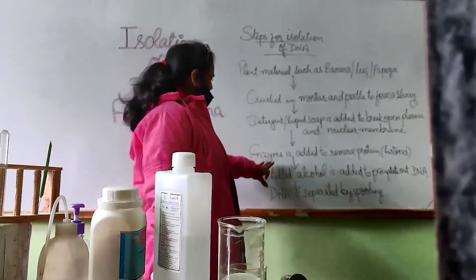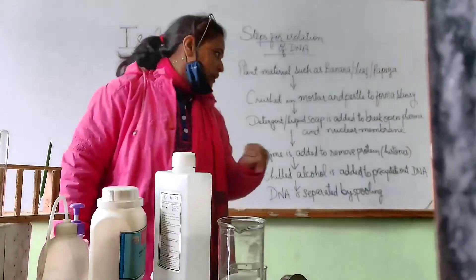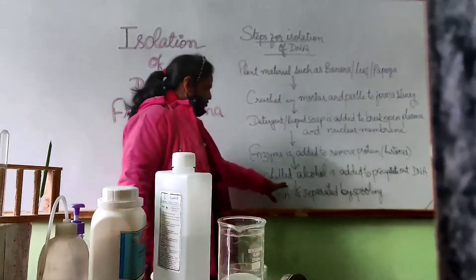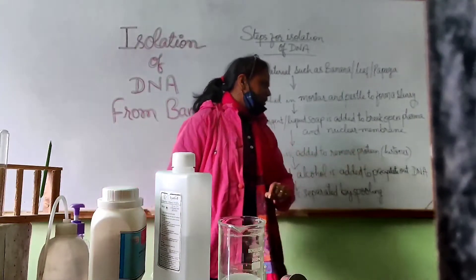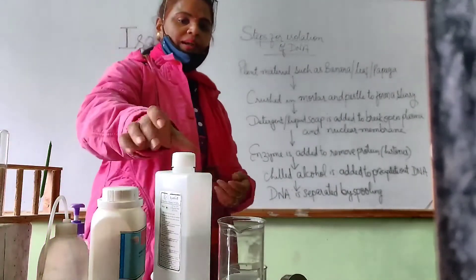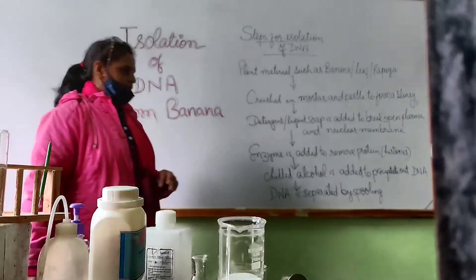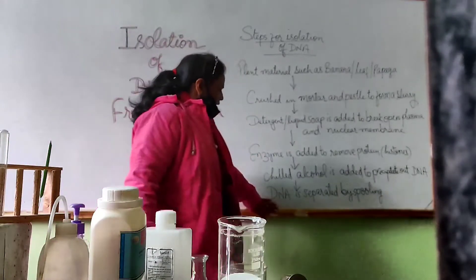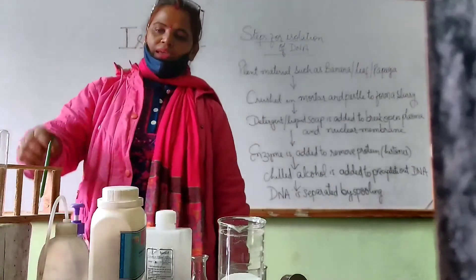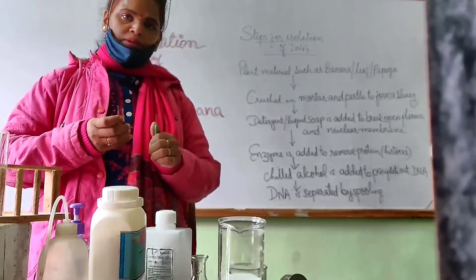Then the next step: enzyme is added to remove protein. With the DNA material, histone proteins are there. Next step: chilled alcohol is added to precipitate our DNA. To extract or isolate DNA, we need chilled alcohol — we have taken this ethanol. So the last step is that DNA is separated by spooling, and with the help of this needle and fork, we will separate out the DNA.